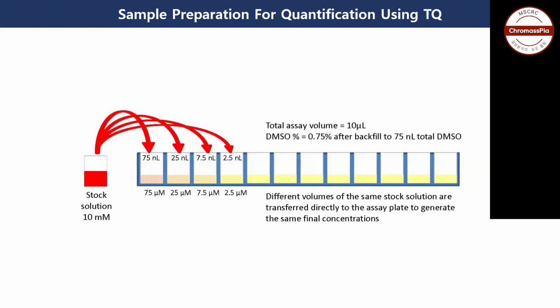I have a question about the video of that engine. It shows that in the method creation we have to select concentration A always. Is concentration A always selected, or can concentration B or C be selected? Actually, you have to give it some starting point. It is just to set your method, so it is a convention to select concentration A. And when you put that method and select the 5 different LC analyses for creation of the calibration curve, then it will take it in such a way that it is not linear concentration.